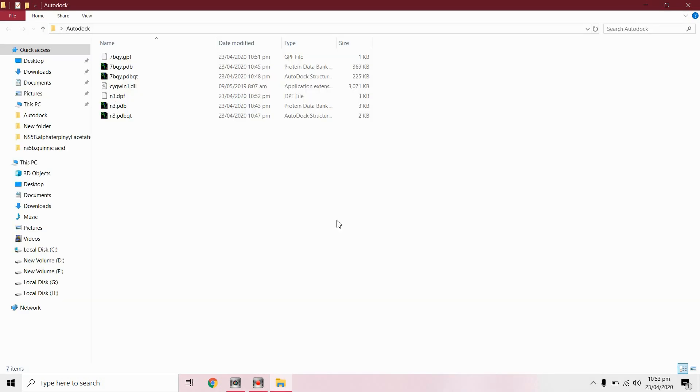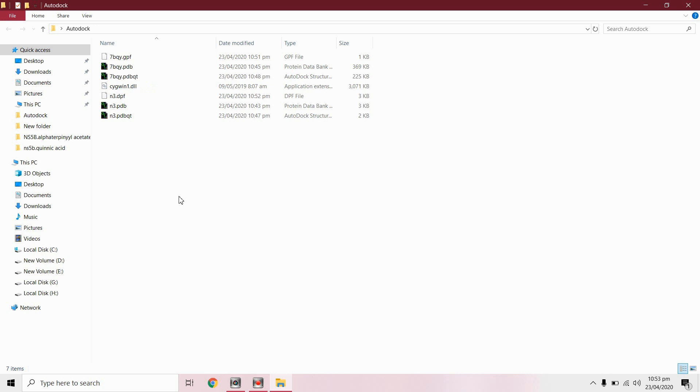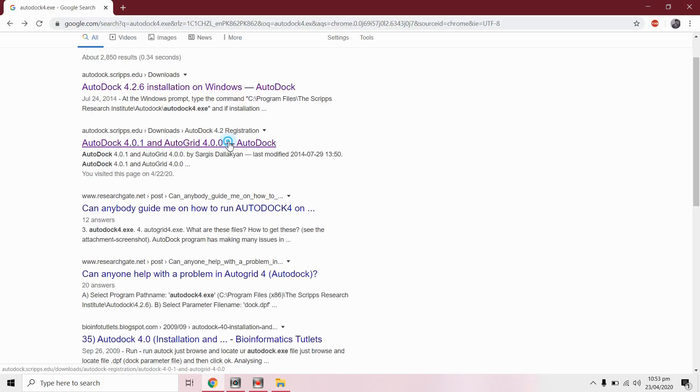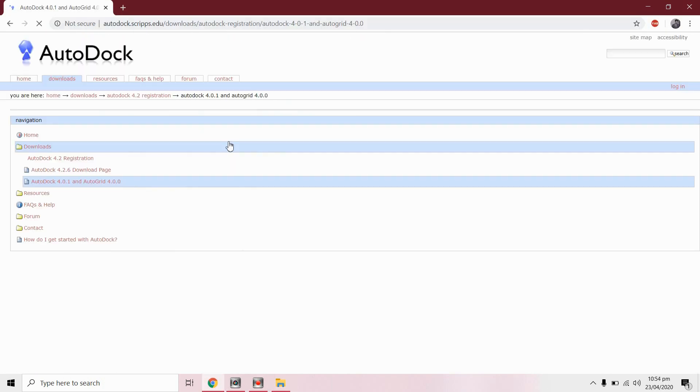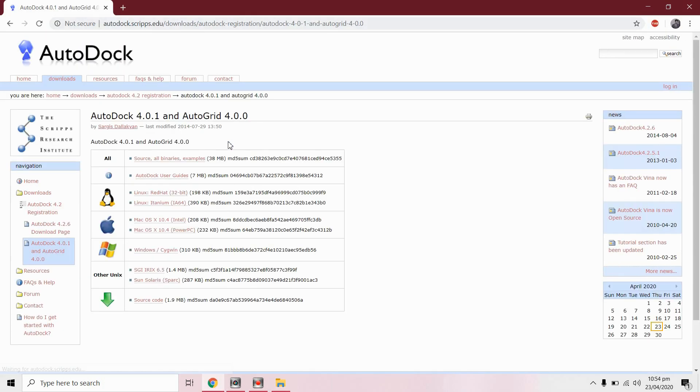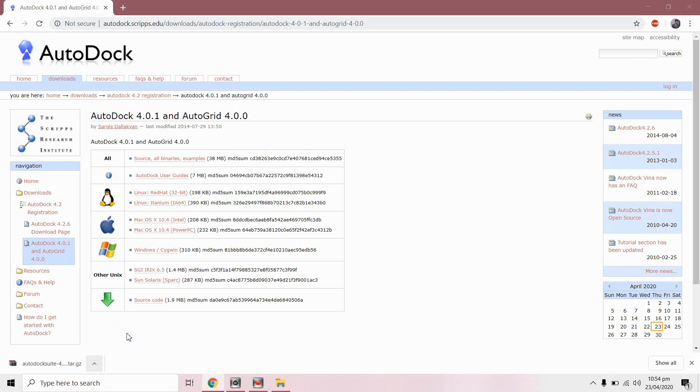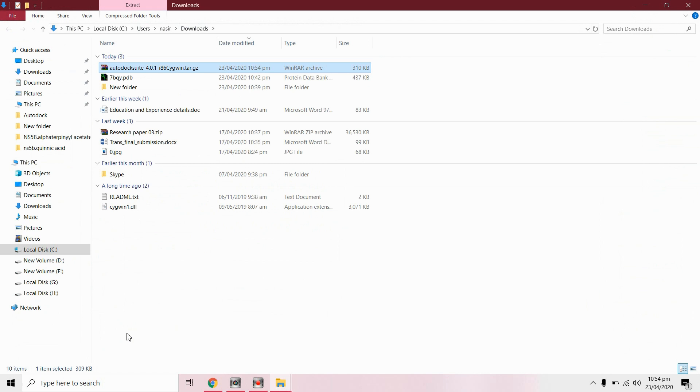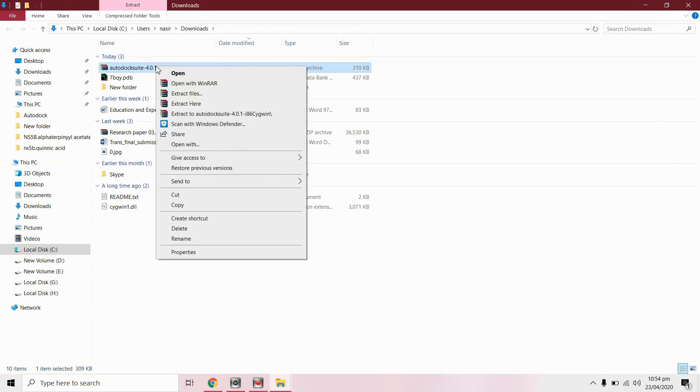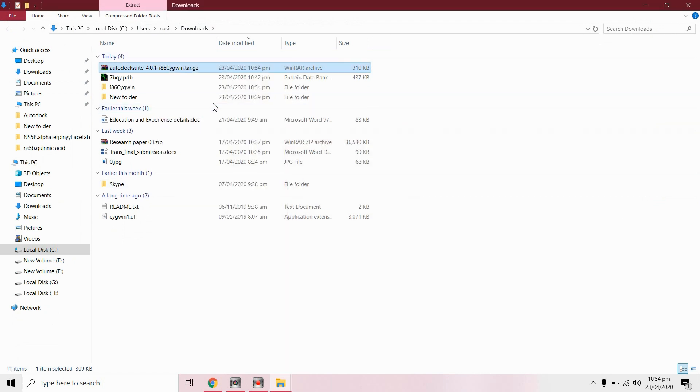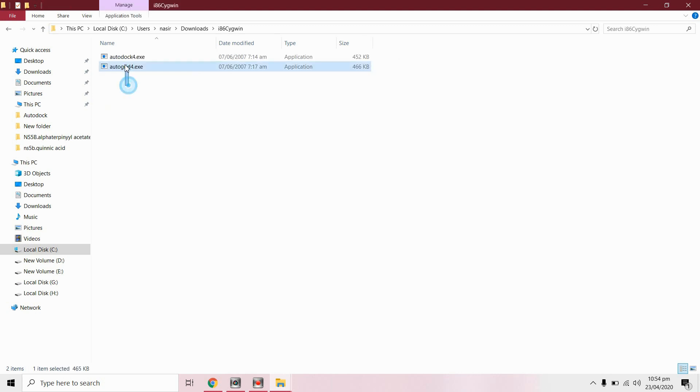We have placed all files in same directory, these files we have prepared. So to run this docking you need to install AutoGrid 4.exe and AutoDock 4.exe for Windows. Extract these files, copy the setup and place in working directory.